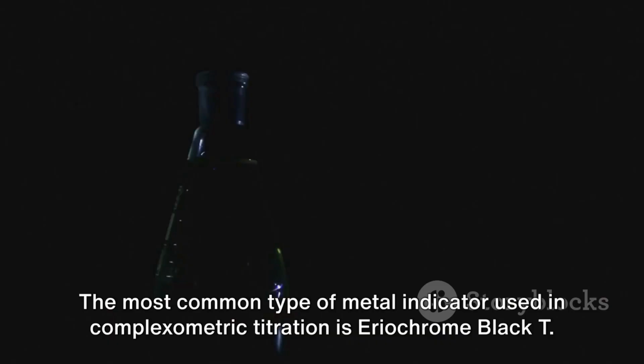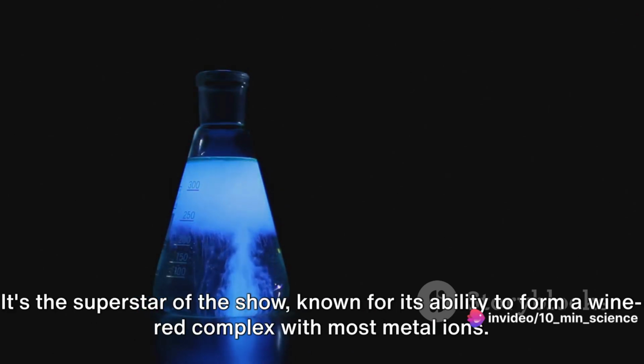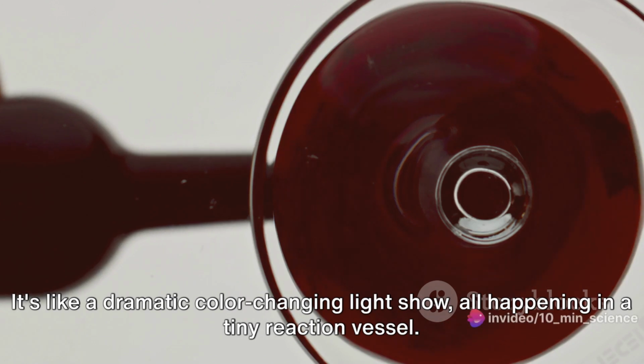The most common type of metal indicator used in complexometric titration is Eriochrome Black T. It's the superstar of the show, known for its ability to form a wine-red complex with most metal ions. When the reaction is complete, the solution changes color from red to blue, signaling the end of the reaction. It's like a dramatic color-changing light show, all happening in a tiny reaction vessel.